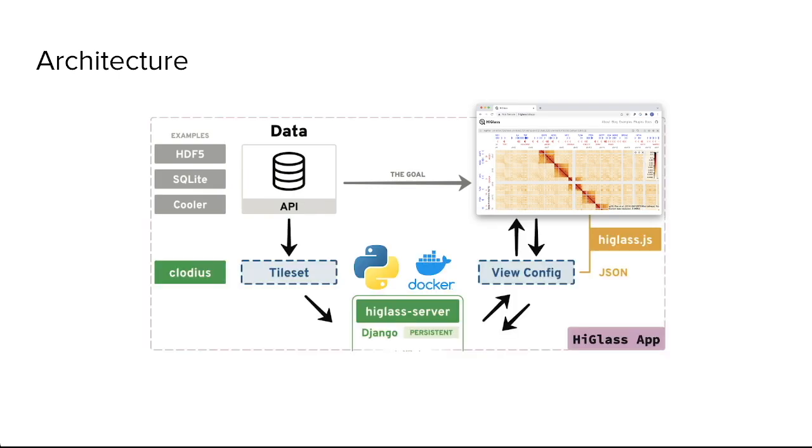Higlass is implemented as a client-server architecture that separates different concepts of this model into different pieces that are either handled by the server or the client. Tilesets is a server-based abstraction for efficient multi-resolution genomic data which can be provisioned to the viewer. View configs are complete configurations and arrangement of the view state based off of the JSON schema. And tracks are visual implementations in the actual viewer. Historically, these modular components were previously tied together within the primary Higlass browser and application, and not exposed to users or third-party developers.